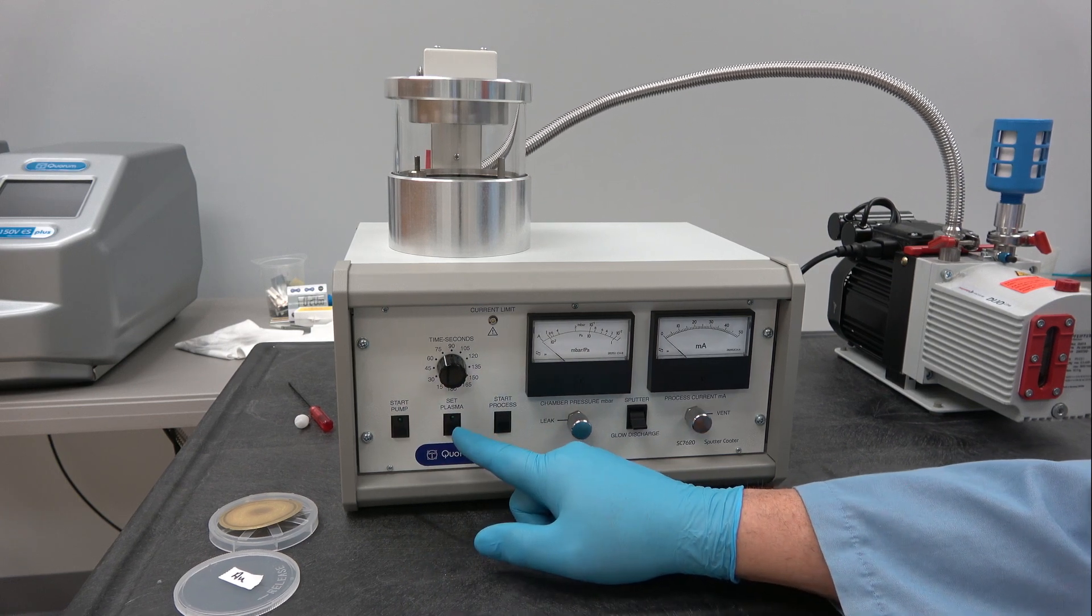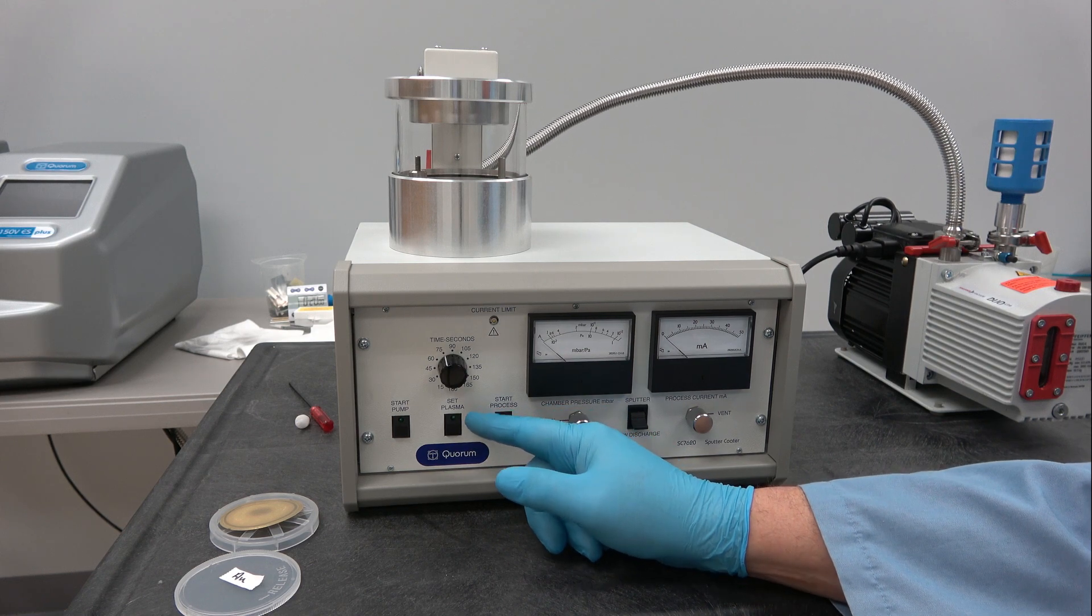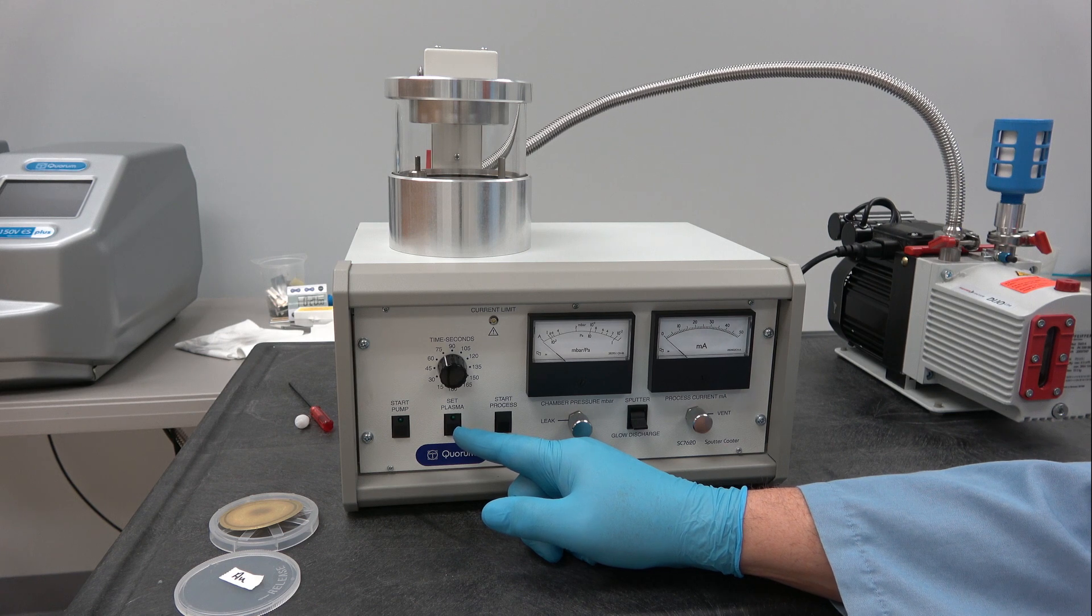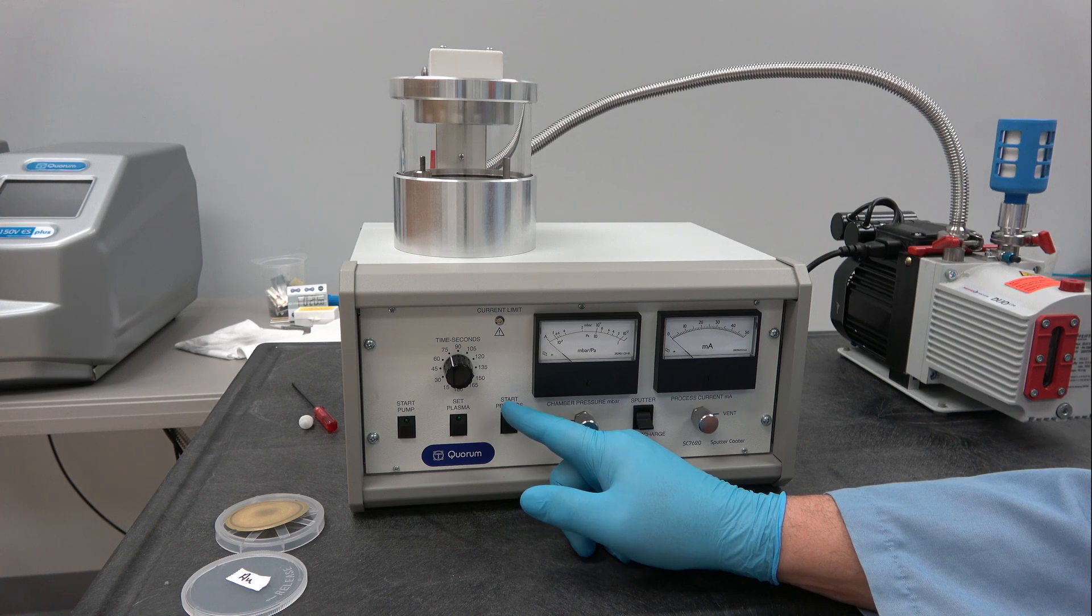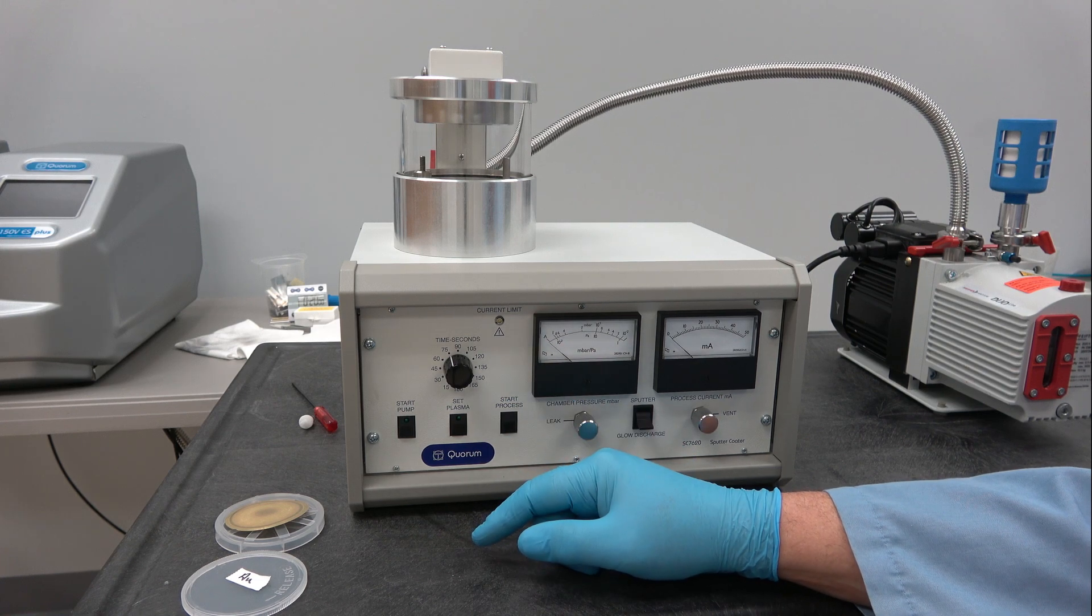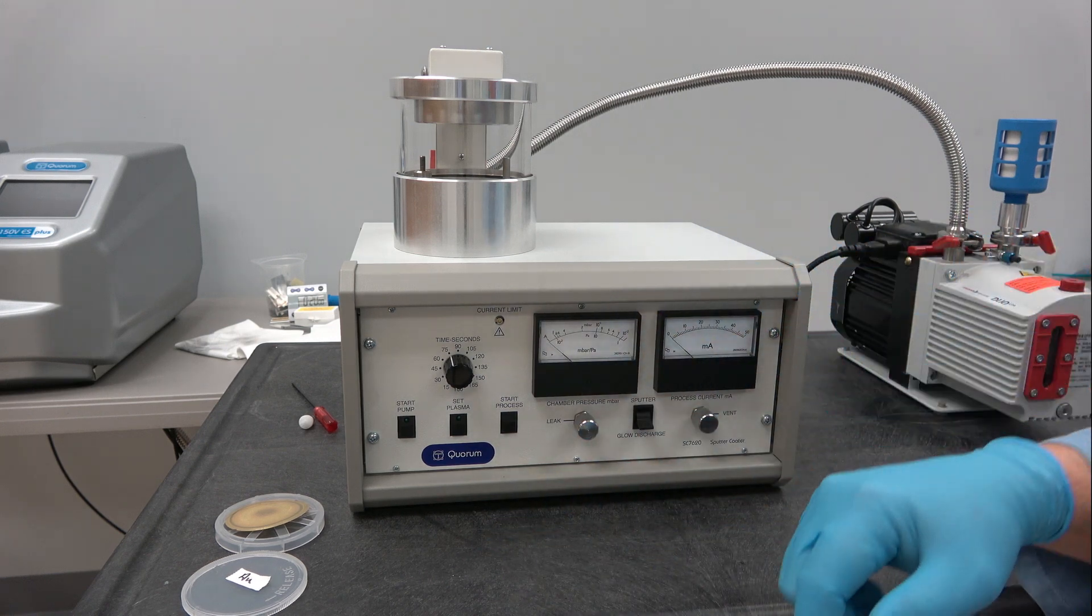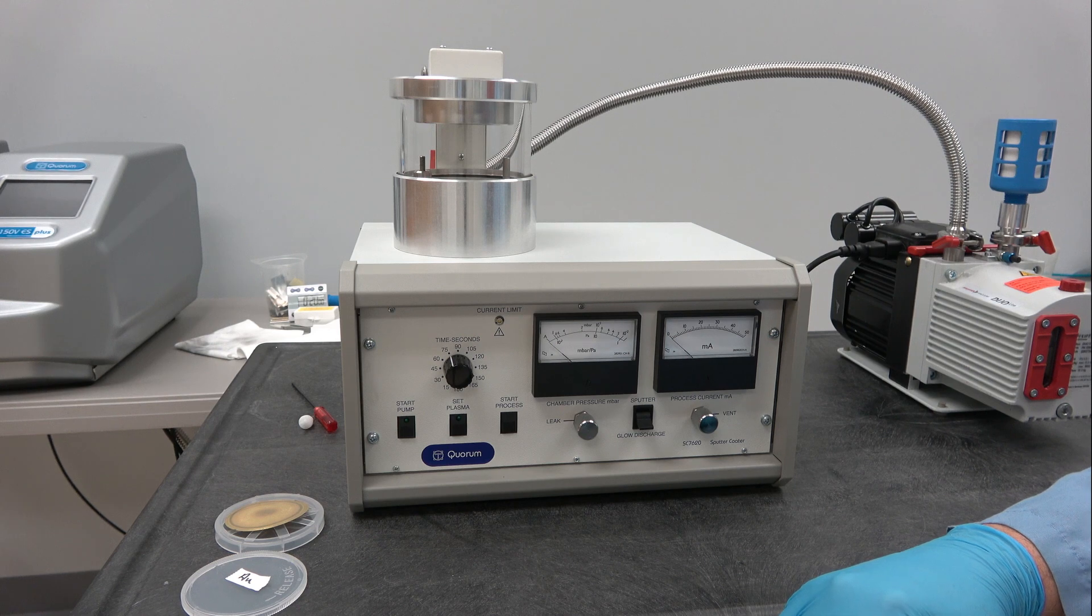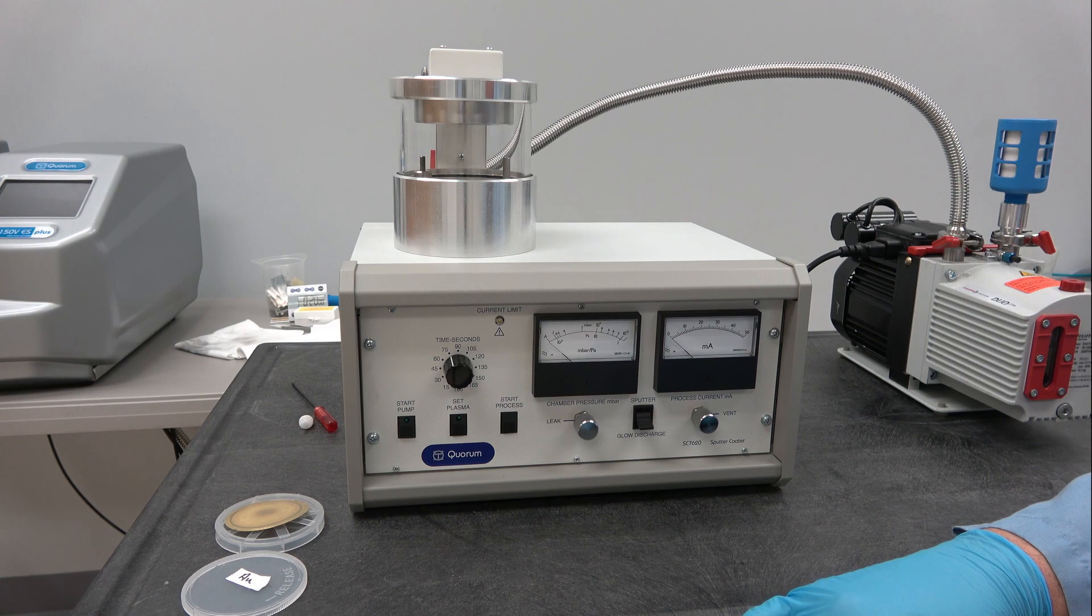Set plasma is where you can adjust the sputter pressure to attain the sputter current you desire. Start process starts the countdown timer to shut off. There is no shutter in this system because it's so simple. So your sample is going to get coated from the moment you light a plasma to the moment you turn it off.